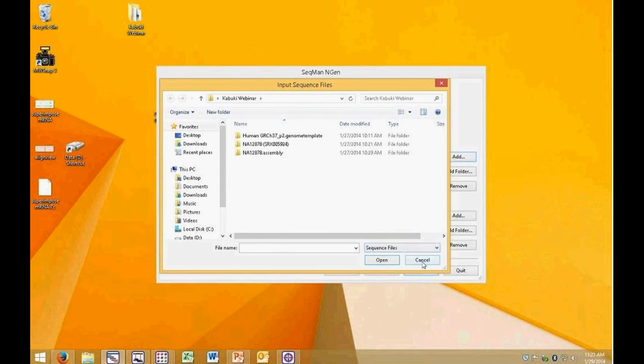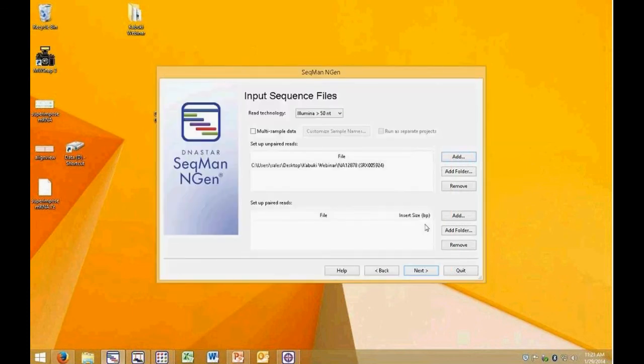Great. And how long would an assembly like this take to run? Sure. So if I'm doing one exome assembly like I'm doing in this particular project, this is going to take about 2 hours to do. If we're going to do many of these together, that does shave a little bit of time off the assembly time. So I know one of our benchmarks is 8 human exomes would take about 14 hours to complete. So again, this particular one exome assembly is going to take about 2 hours, maybe a little less.